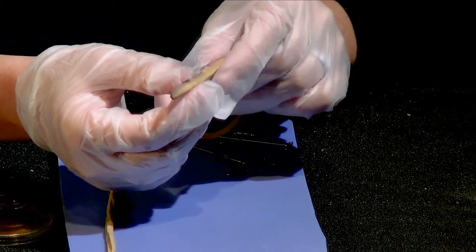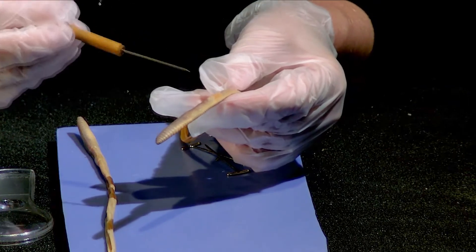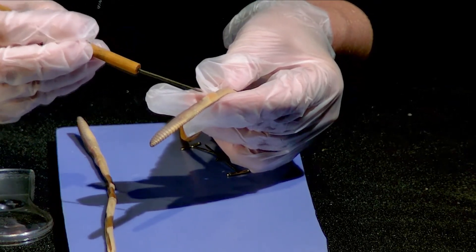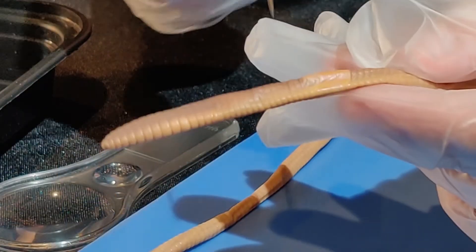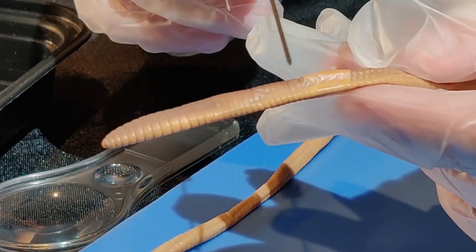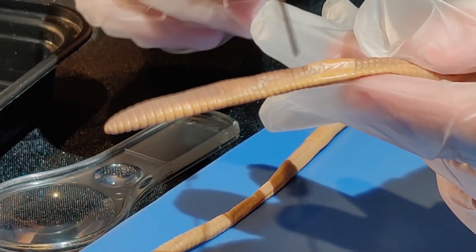Flipping the earthworm over, you're going to notice that there is a differently colored spot on their back. This is an organ called the clitellum, or saddle, and this is the reproductive organ.